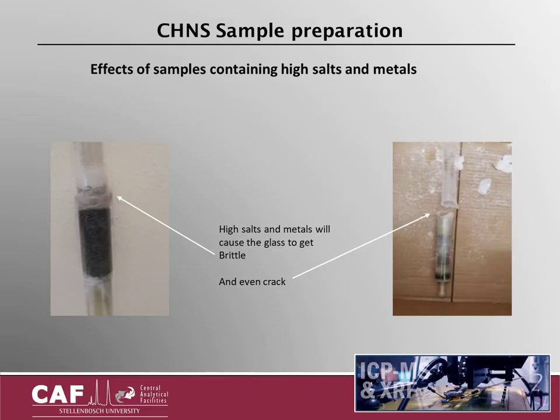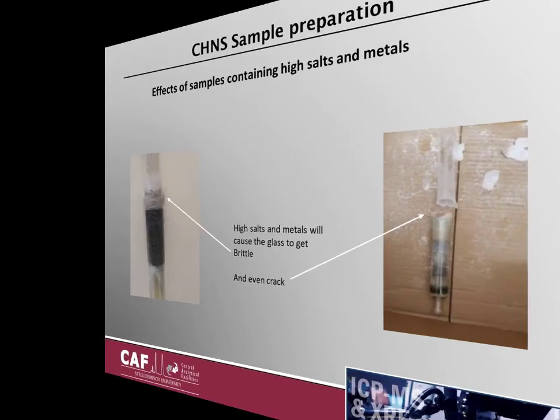Samples containing salts will be evaluated, as high salt content can damage the tubes. It is therefore crucial that all available information about your samples are given to the lab to ensure proper sample handling and preparation for accurate data.